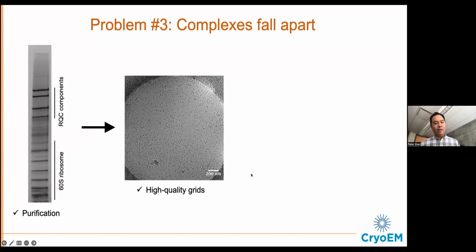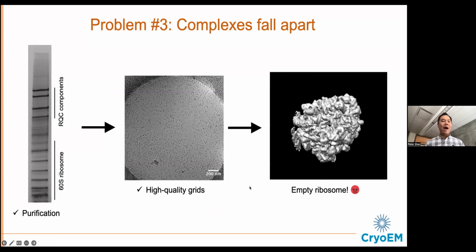We collected a huge data set at the time, something like 2,000 micrographs, which at the time took a heroic effort, and semi-manually picked hundreds of thousands of particles, which, remind you, we didn't have really robust auto pickers at the time. But the point is that it took several weeks of data processing just to find out that our 3D reconstruction was that of an empty ribosome.